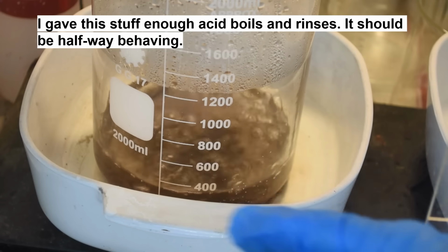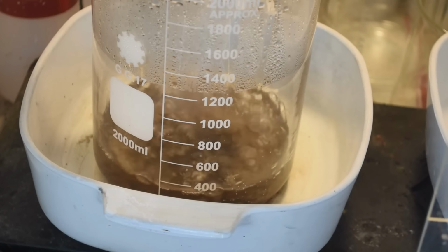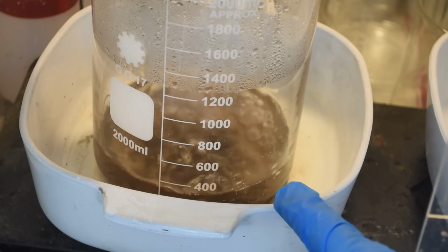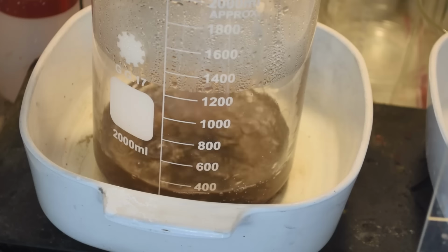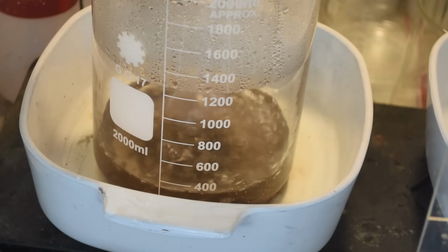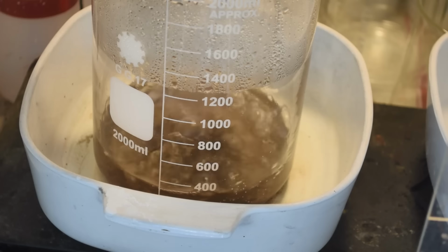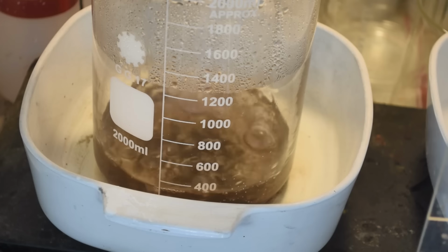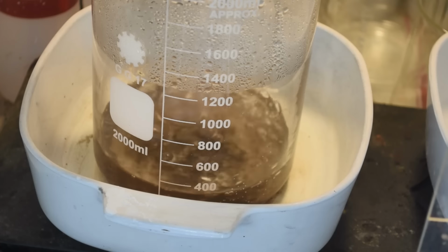It's kind of agglomerated together in the middle of the beaker there. There's a little bit in the water column, but not a whole lot. I'm going to let it boil a little longer, see if it agglomerates any more. And then I'll probably decant off this liquid through a filter to catch all the little bits of gold in the water. Save that for future processing. And then probably transfer the gold to a smaller beaker so that I can give it further boils. Since it's behaving itself, I think we'll do a hydrochloric acid boil and then some more distilled water boils to clean it up. All right, so let me get set up to filter this stuff while it boils a little while longer.